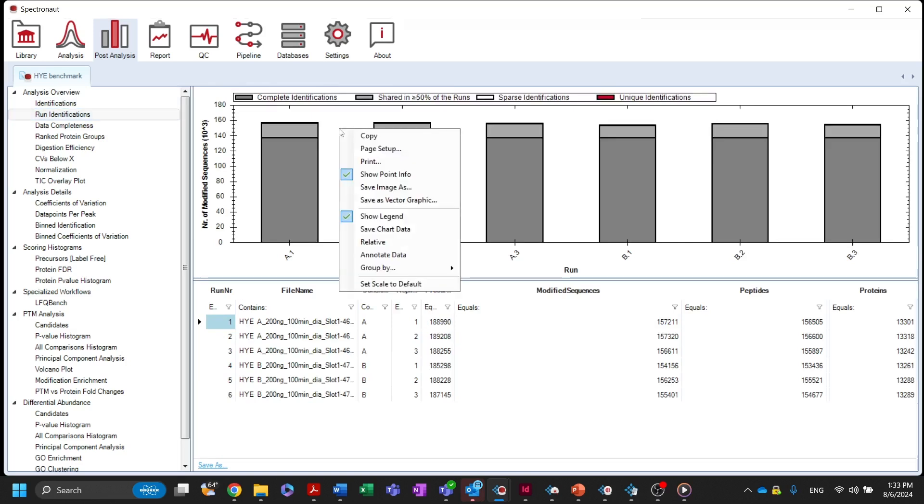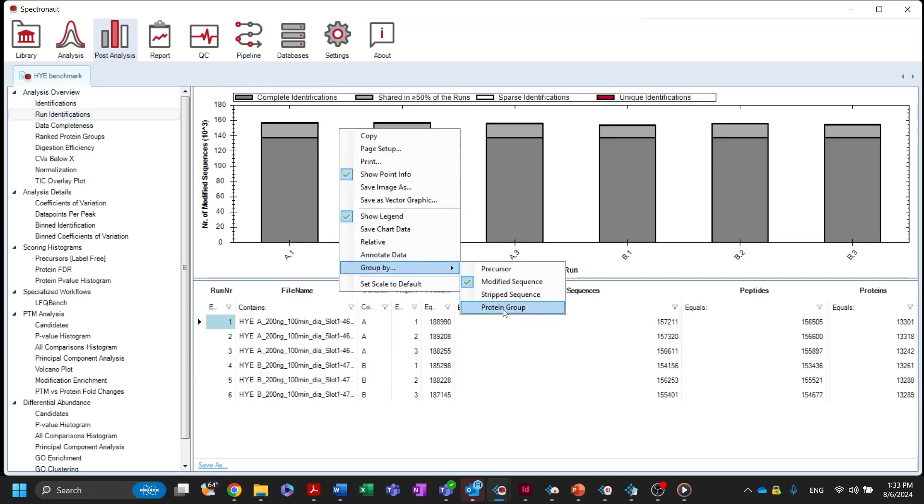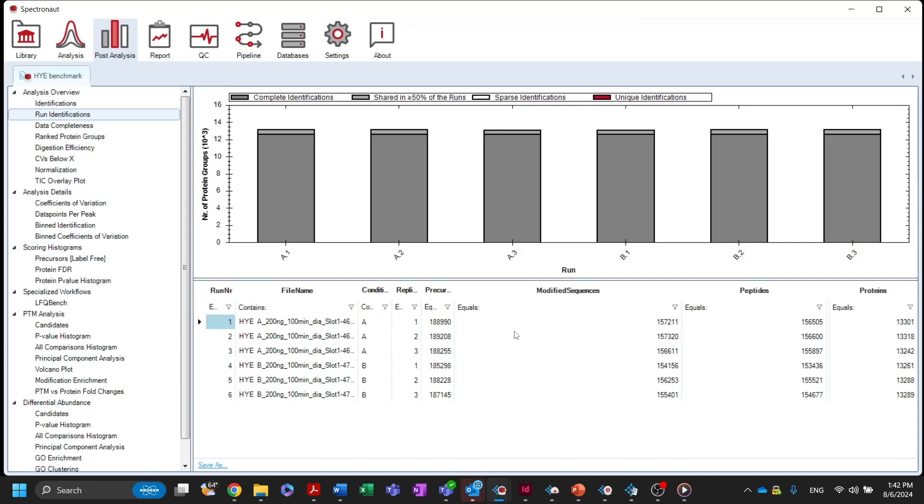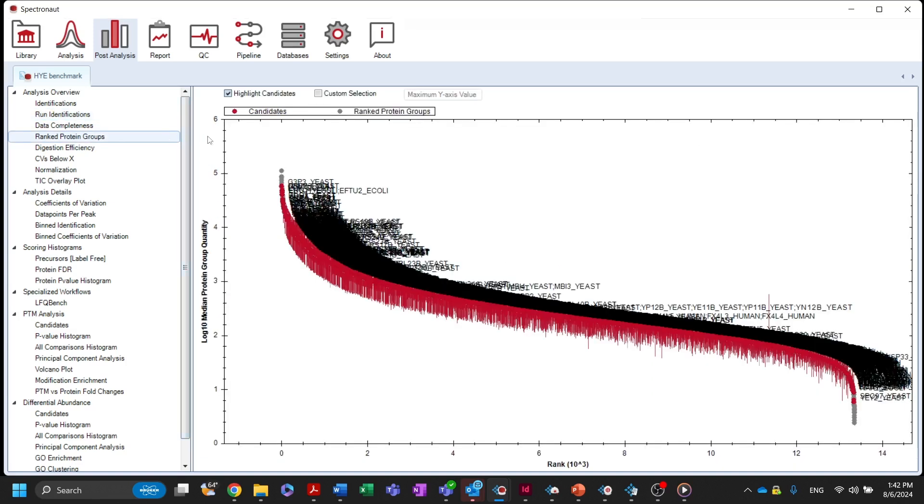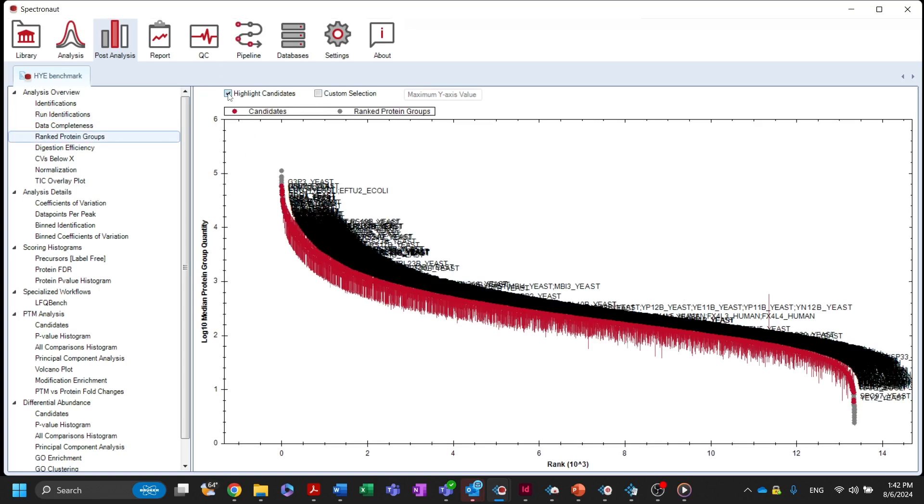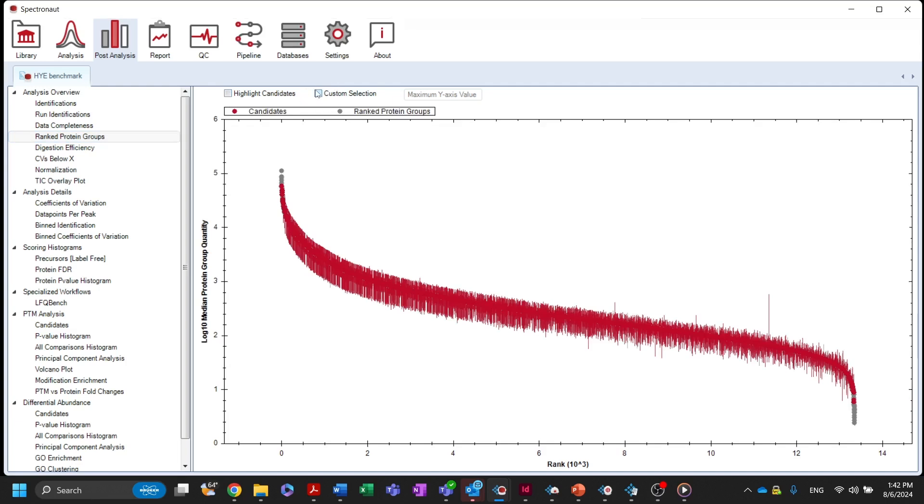Right-clicking on this plot allows you to choose which level to group by. The ranked protein groups plot displays all identified protein groups ranked according to their quantitative value. You can choose to label all candidates of the differential abundance analysis or highlight a custom selection.